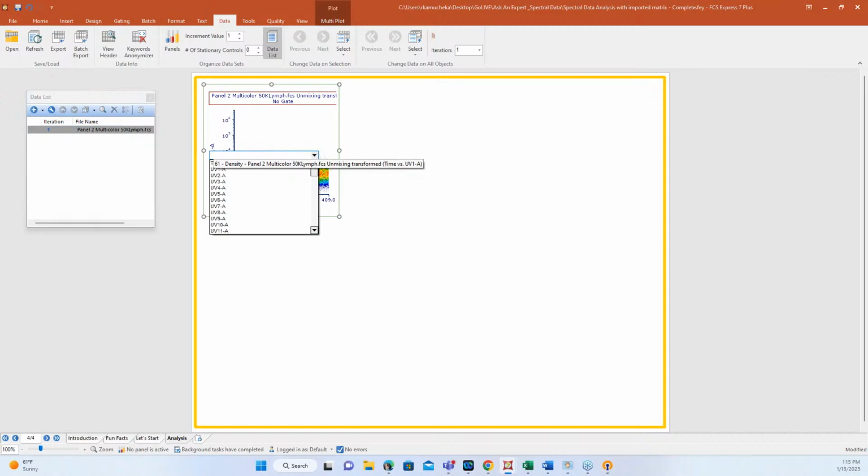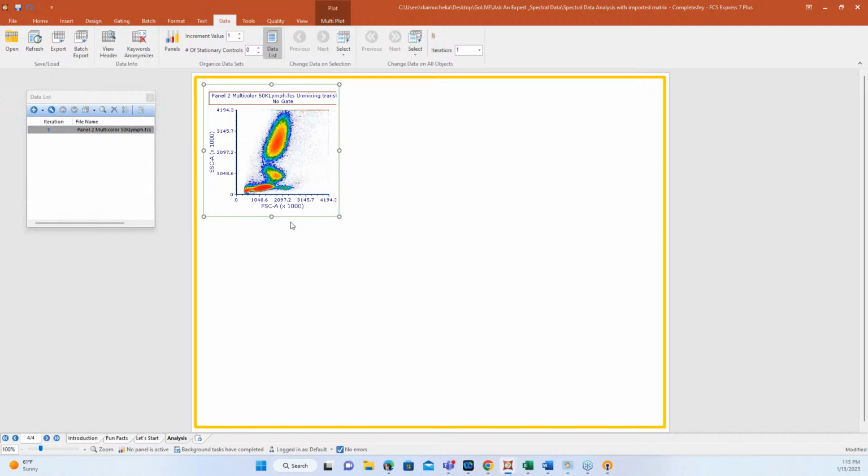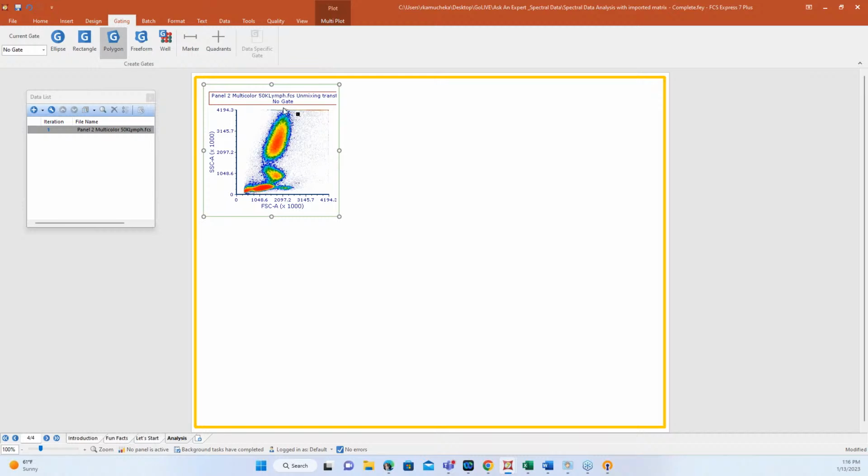With our parameters, same thing stands. You don't have to dig through all 60,000 different parameters. Start typing. It's going to drill down that list for you, so you don't have to work so hard. So then we have the ability to get to our parameters just as easily as if we were working with something else.